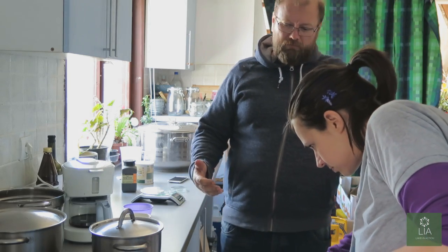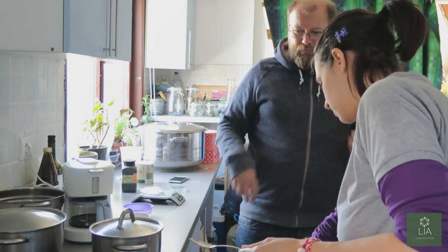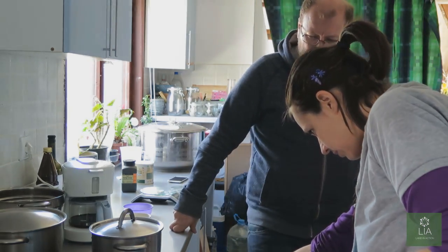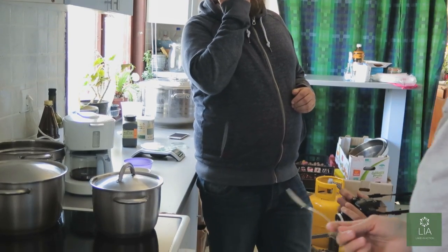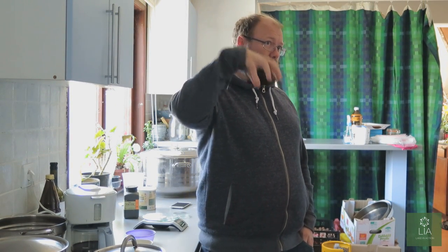Switch it on. We're not going to boil it. We're just going to help make everything dissolve. So we don't need to use the highest. No, we need it on a relatively low heat. That'll do. So we don't want to boil the agar. What we want to do is just dissolve the agar into the water, because it's going into the pressure cooker. So it'll do its boiling inside the pressure cooker itself.